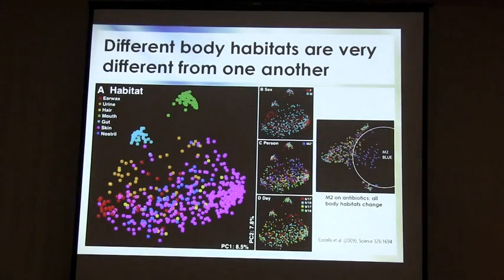So I'm going to skip over that in the interest of showing you some of the things that you can do with QIIME and some of the other tools that we're developing in the lab. So one thing we did relatively early on, and this was the work of Liz Costello, who's now working with Dave Relman at Stanford, and this was in collaboration with Noah's group and Jeff Gordon's, is putting together an overall map of the human-associated microbes.